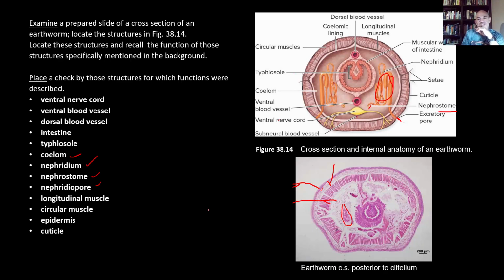Now, that you're going to see those in an actual dissection, it's going to be tough to find a specimen that was cut just perfect right through an area where you pick up all of those structures. So in our ideal model, you can identify those. In a real one, you're limited on what you may be able to identify. But there are some things you can identify.